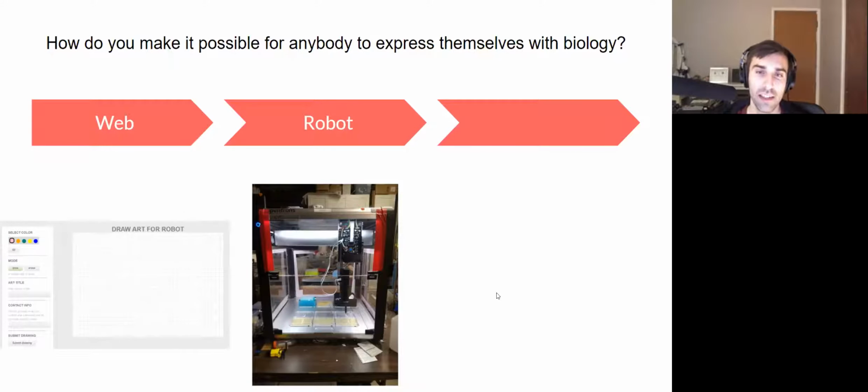One is this concept of kits. So this is the BioBits Bright. It's just one of a number of kits circulating out there, and the idea is they're these low cost little packages that can be sent out to schools or anyone who wants to learn biology, and they're able to do a science experiment hands-on in a semi-controlled way. So they still get to have the fun of the experiment, but they don't have to have a whole biology lab or be someone who's really good at designing experiments, for instance. This is a great way in.